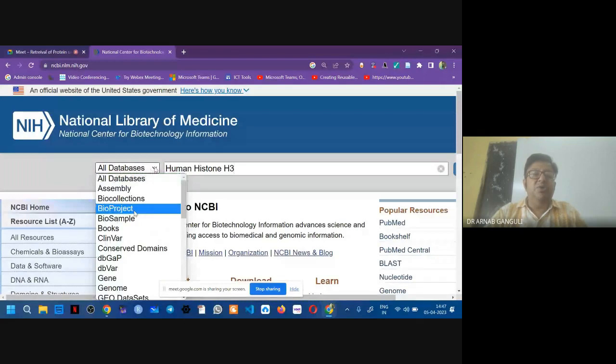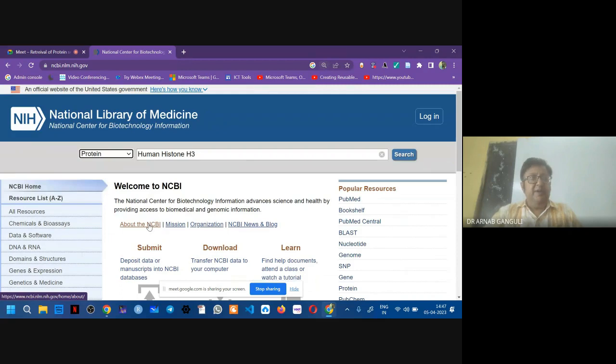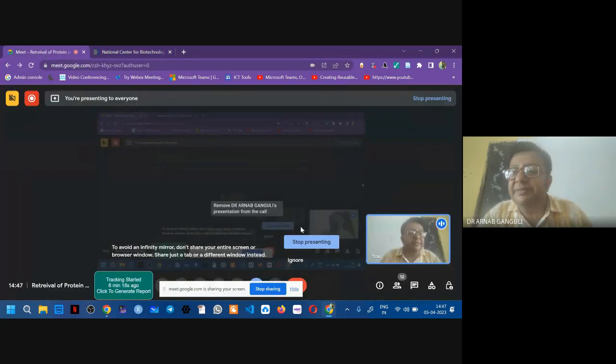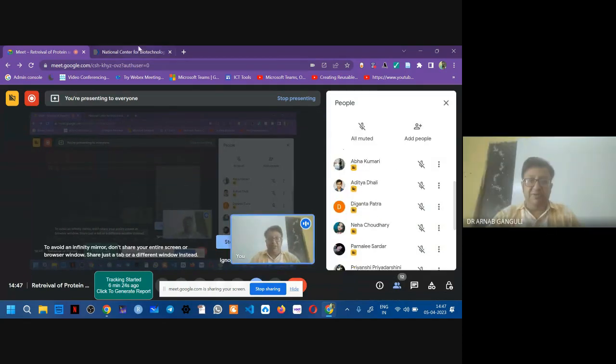Then we go to protein. Select protein in the search box. Point 2. Select protein in the search box. Okay, did the online students write it down? Yes, sir. Okay, very good.